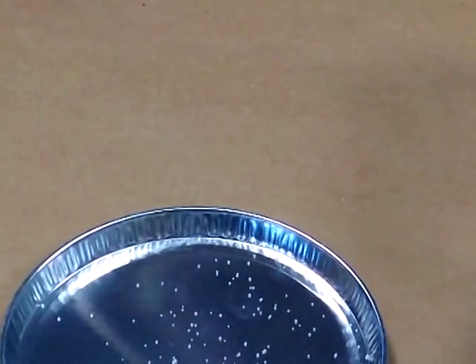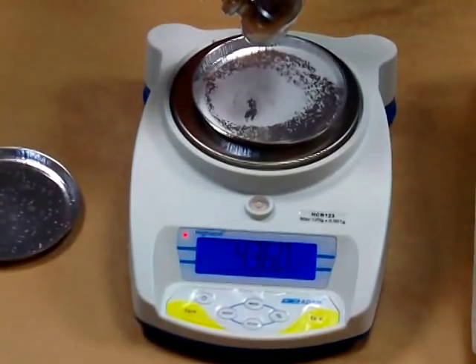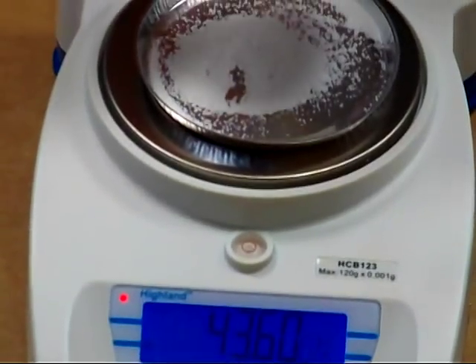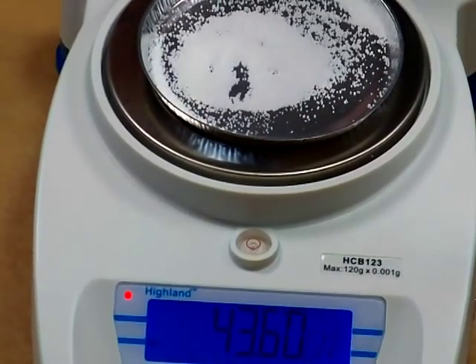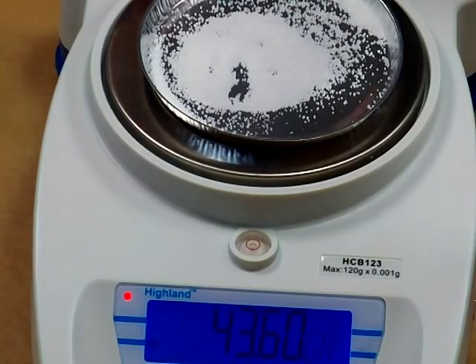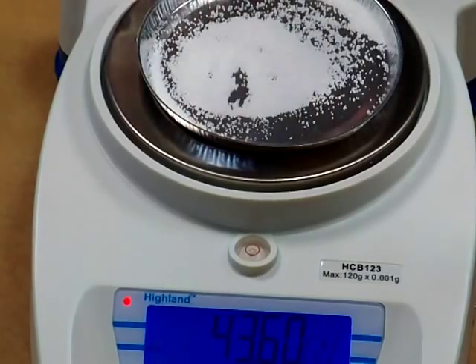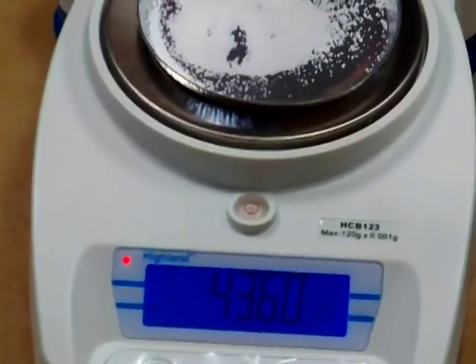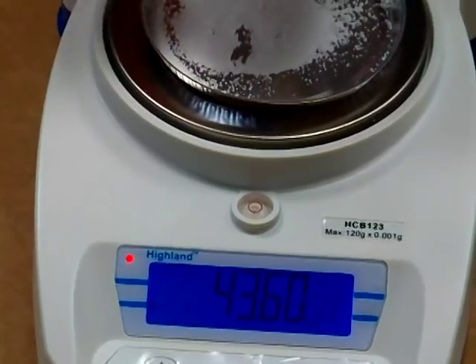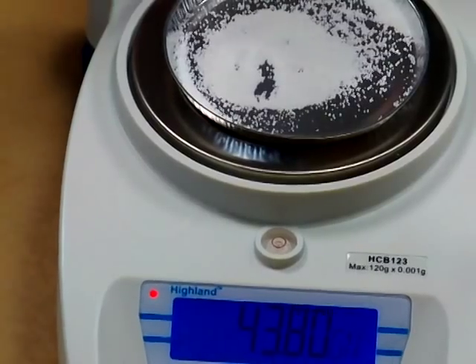You can see maybe ten grains of salt at a time. Now I'm adding it to the Atom Equipment HCB123 — if I add salt very slowly, the display a lot of times won't even move. The reason is that manufacturers of strain gauge based scales have what we call auto drift or auto compensation software. The electronics see a change but the software is written to treat it as drift due to temperature on the load cell, not a small weight gain to the platform.